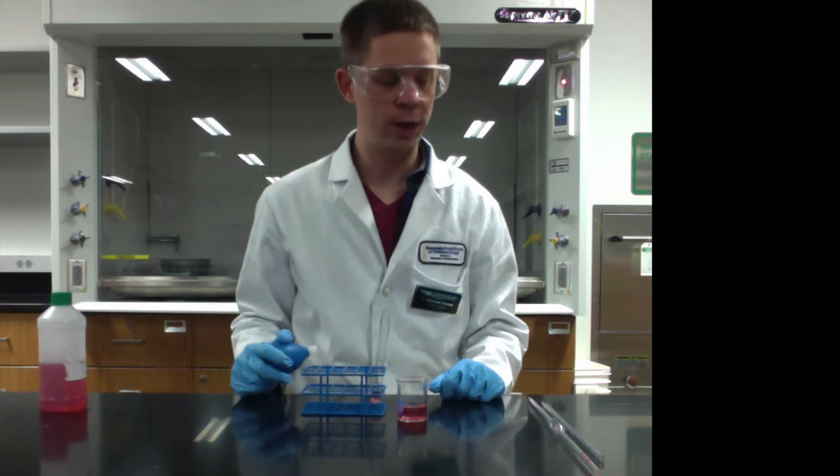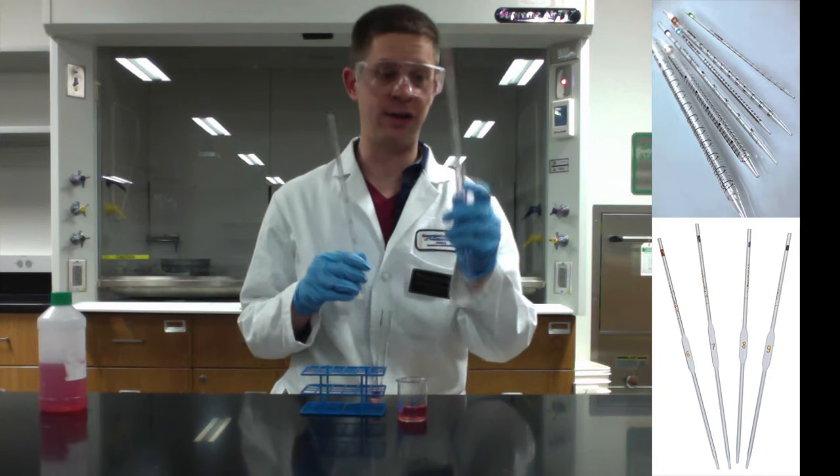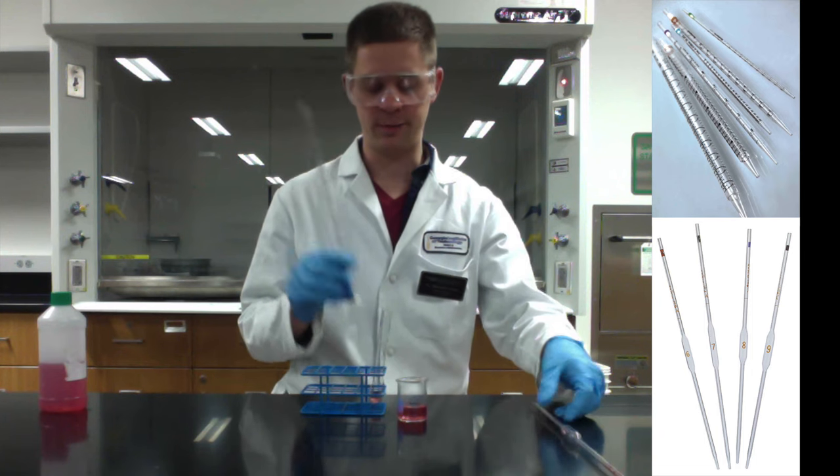So that's basically it. To quickly review, we looked at the two different types of pipettes. We've got the volumetric, which has the bulb and the single marking, and the serological, which is graduated like a graduated cylinder.